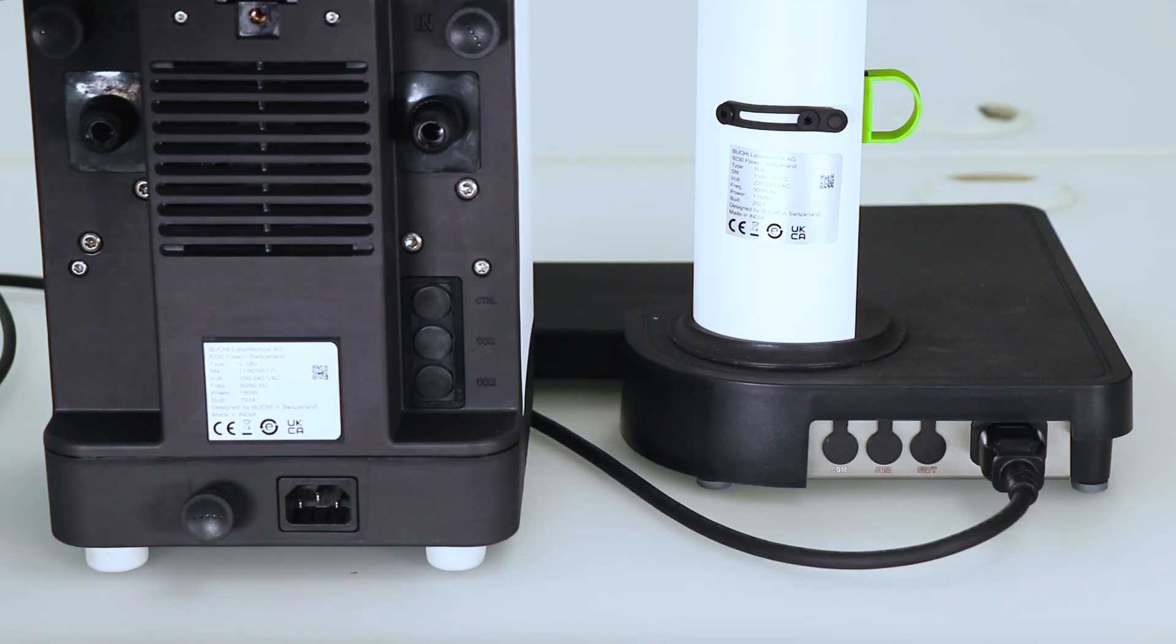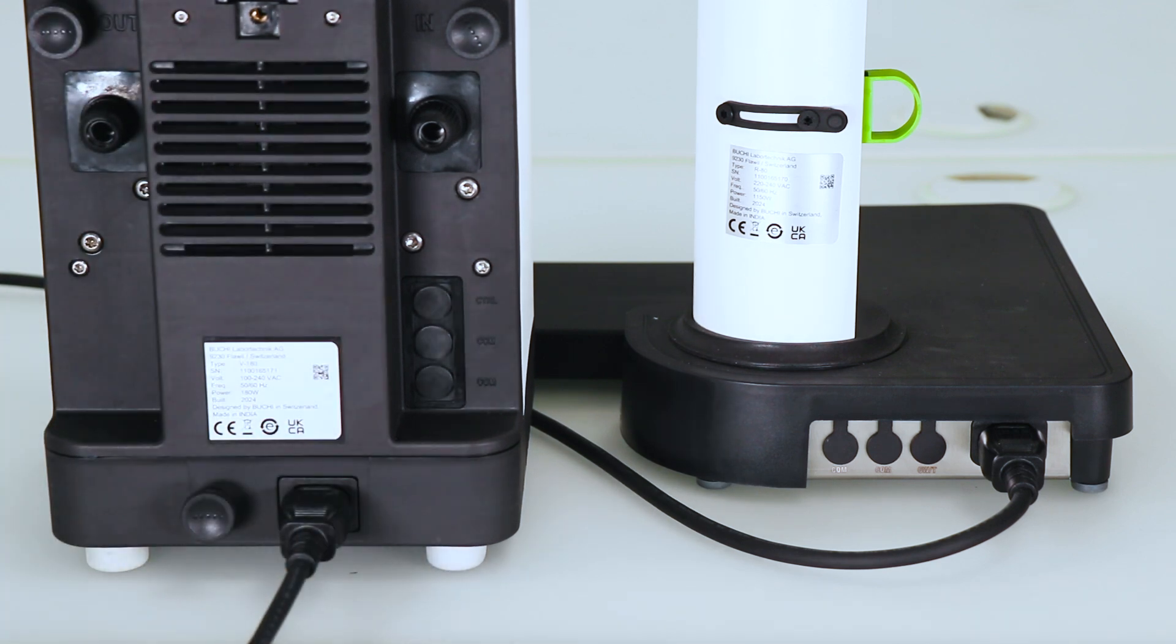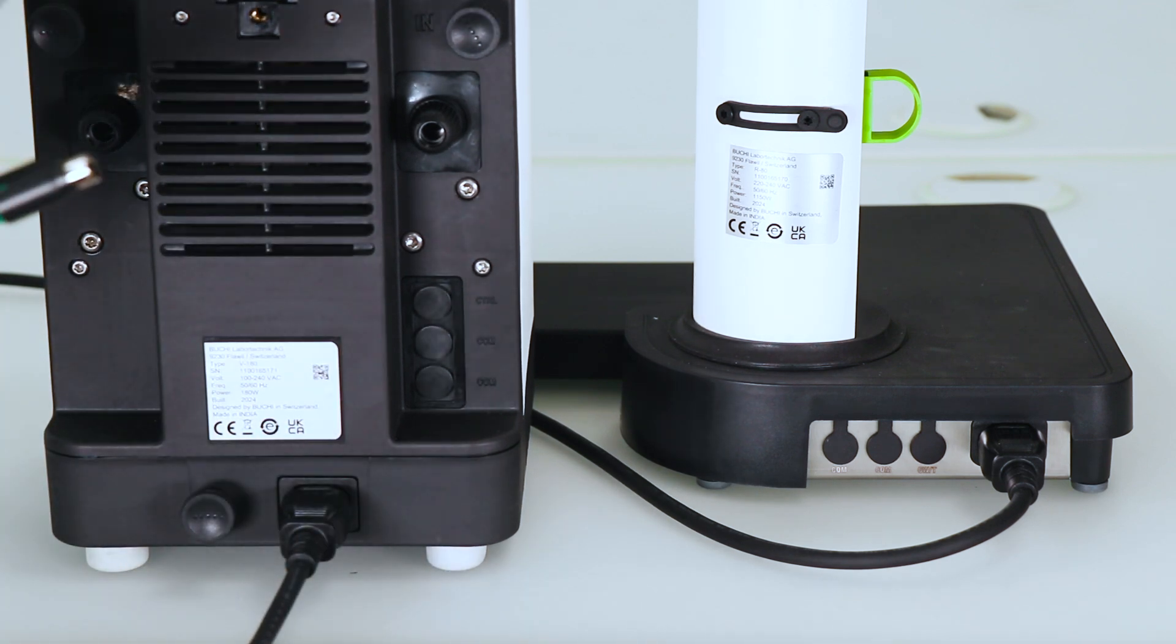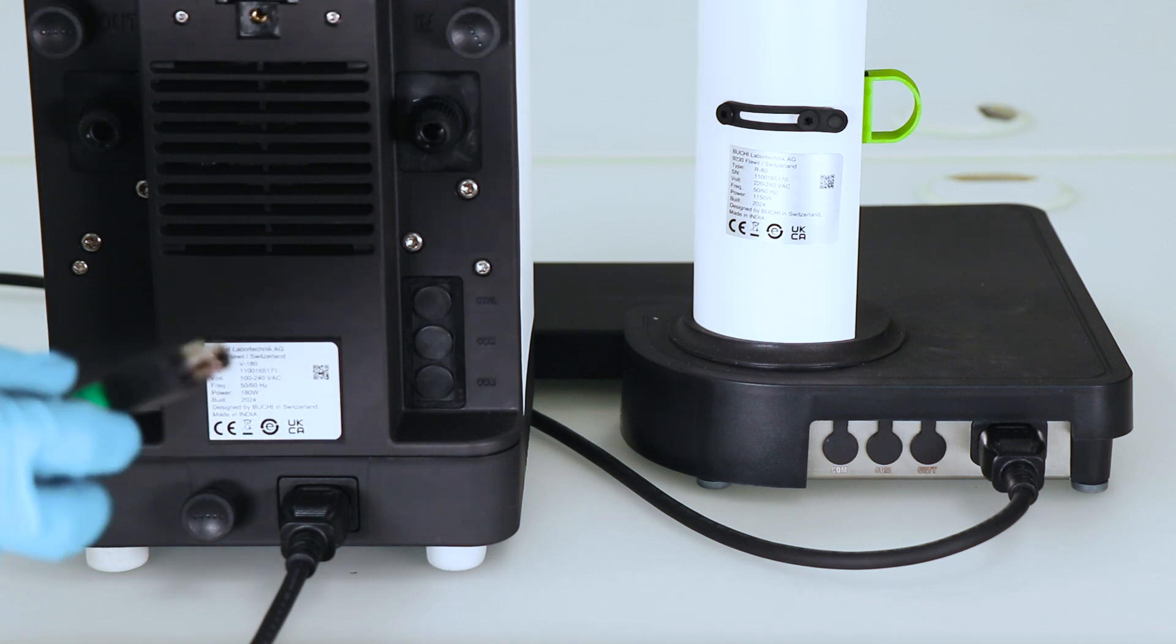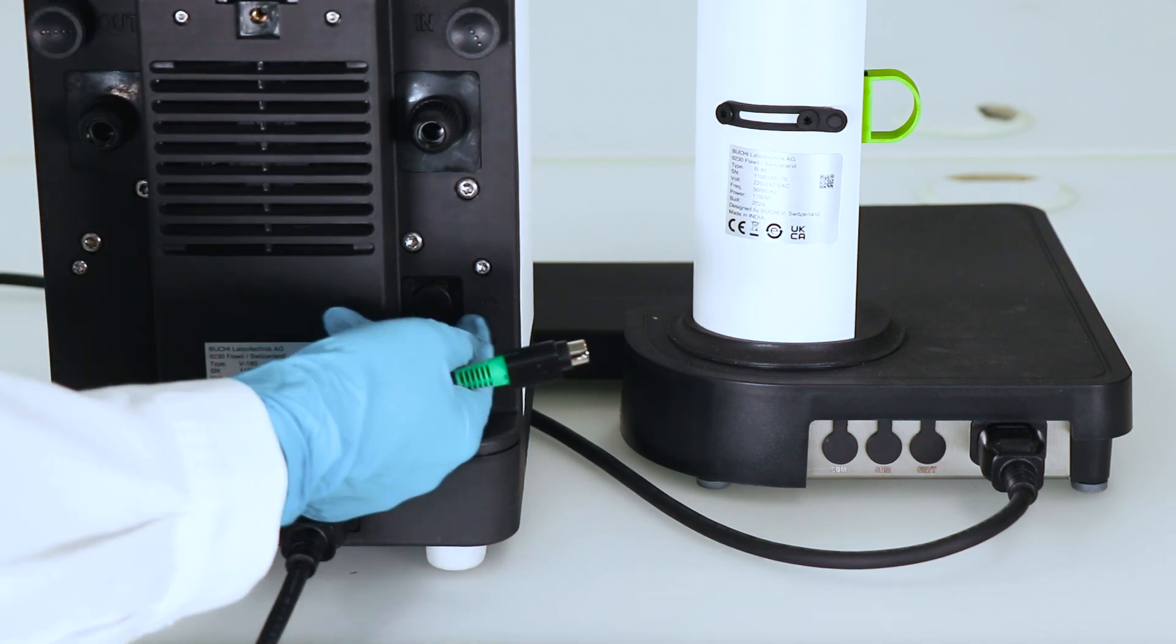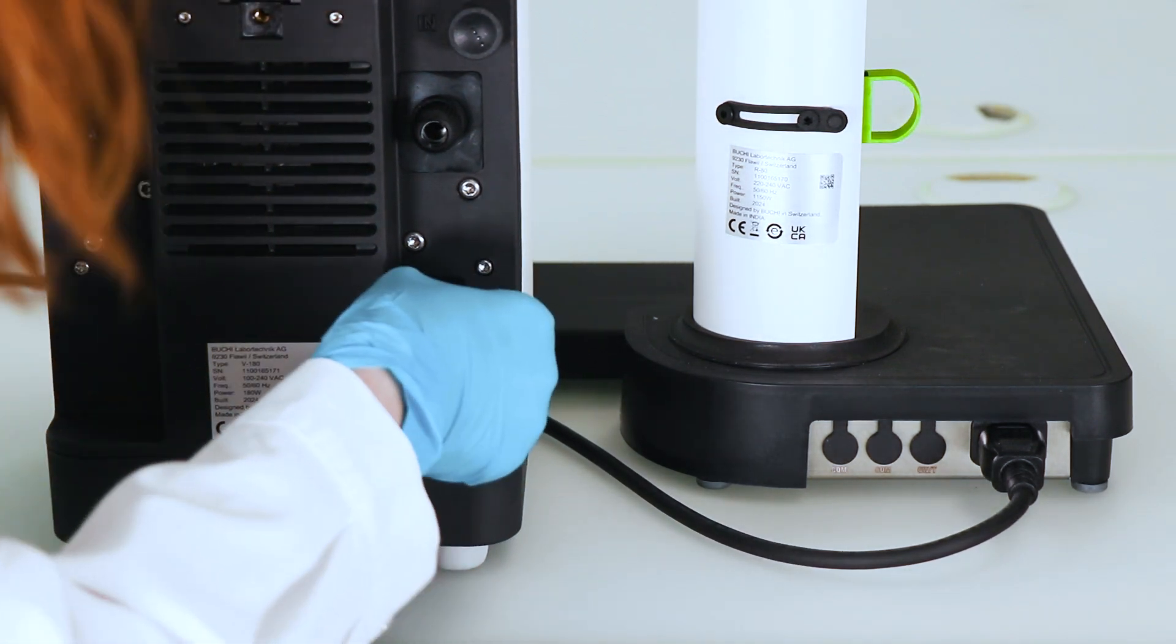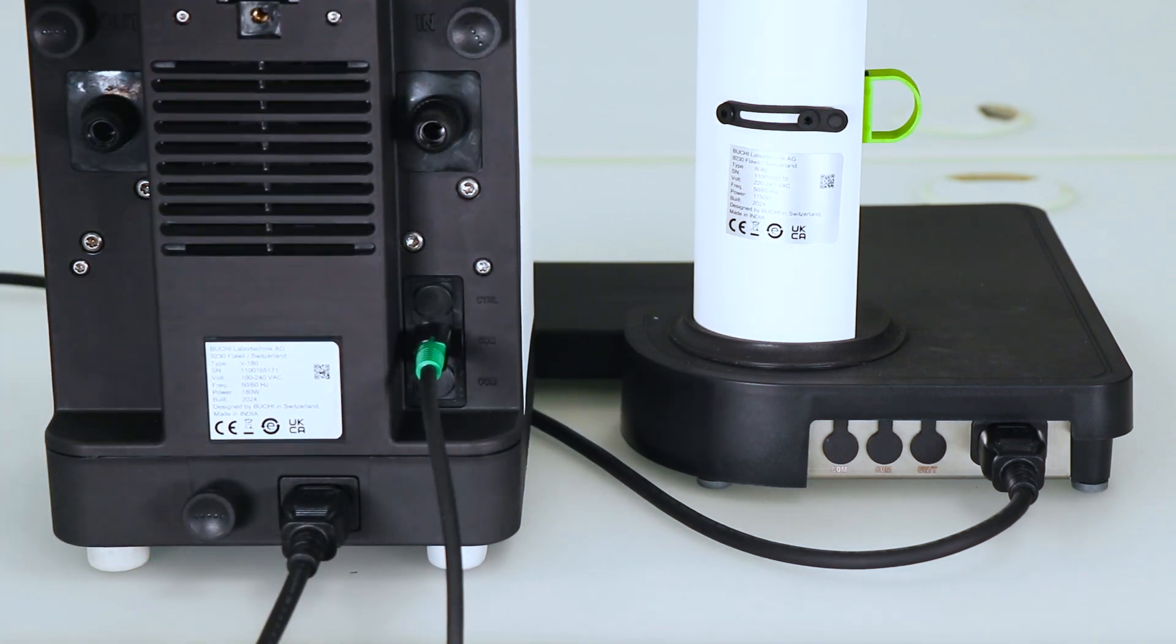So we also connect the pump to the power. And we connect the pump to the R80 with the Buhicom cable. These are the ones with the green parts here. So you go to the outlet that says com here. And do the same on the R80.